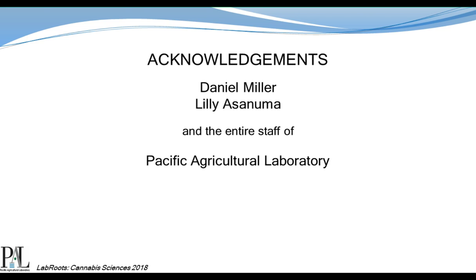If you've got two platforms, then you can pick and choose, which lets you optimize the compound response, which then lets you get back to these large dilution factors that I keep talking about. Using an LC alone, the maximum dilution factor will be determined by the poorest performing compound. So if you move those to a GC, you may be able to increase your dilution factor and then take advantage of a lot of the stuff that we discovered during this talk.